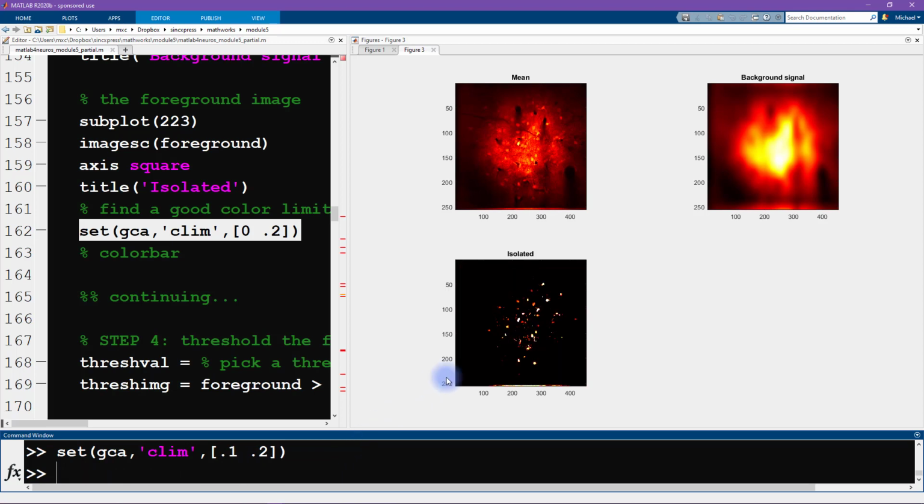So now the idea is that anything that's black in this image is going to be left out of the thresholded image. Now, 0.1 seems to be too stringent because we removed a lot of cell bodies. So again, this is something that I spent a few minutes playing around with, and I came up with a threshold of 0.05.